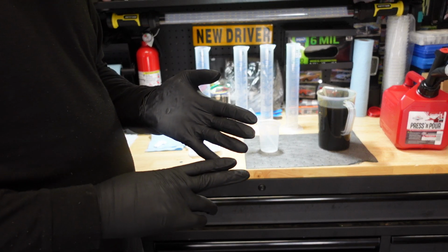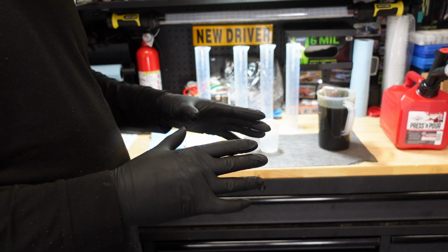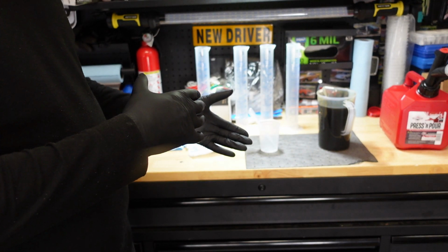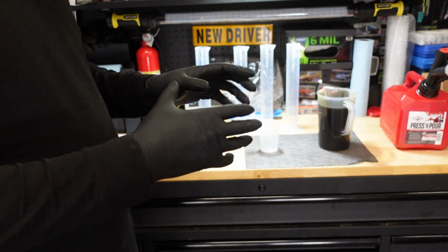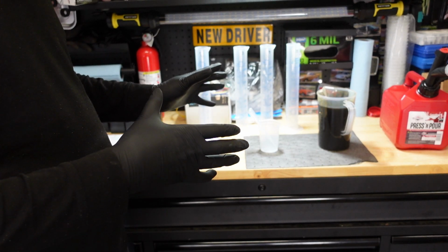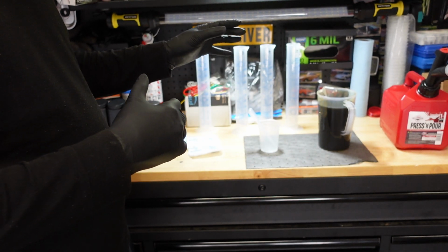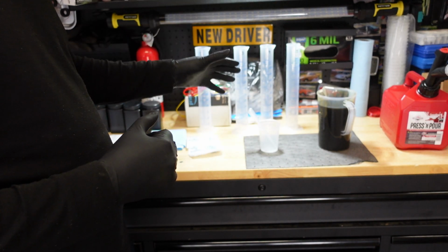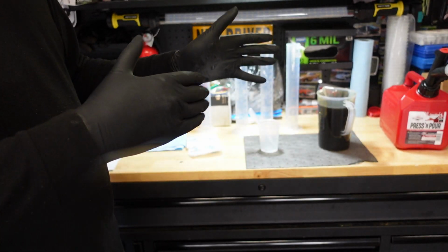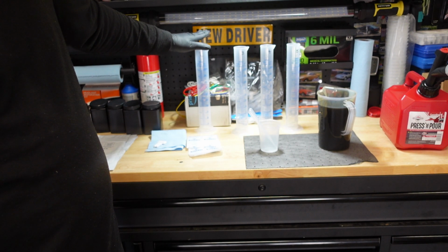Now, this video is going to be in 3 parts. This part is just going to show how I'm going to spike the samples and then collect the samples to ship them out. The second part is going to be a little more in depth about what exactly is going on here and how this system can effectively pressure test their method for robustness. And the third part is going to be the results. This video will be time-stamped, so you can feel free to go to the part in the video. And what I'm going to do is spike this first one here. We're going to walk through this one.